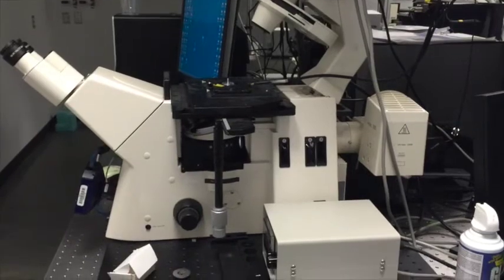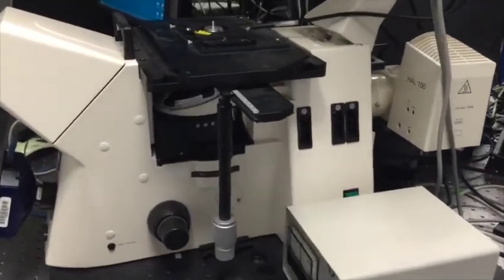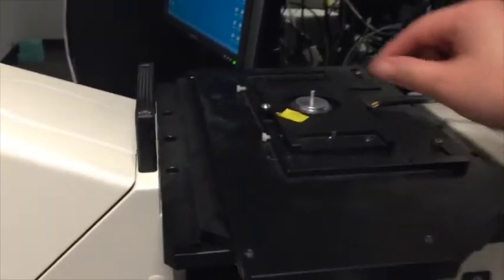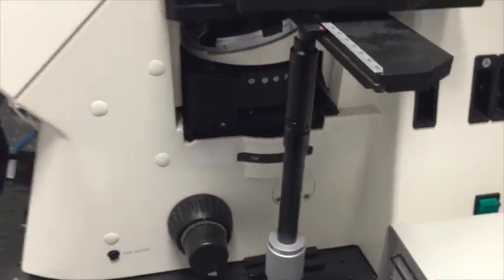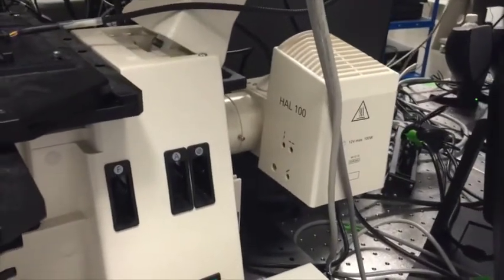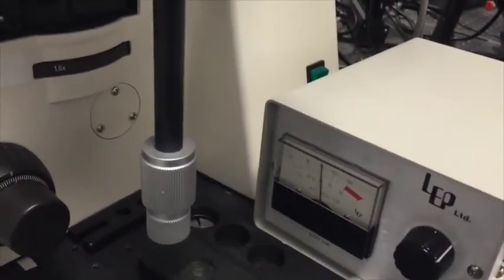What we are looking at right now is a real dark field microscope. This is actually a reflected dark field microscope. So the sample is placed on the sample holder, and the sample holder is on a stage that is operated by this stage control. The light source we use here is a tungsten halogen lamp. You can tune the intensity by tuning the input power.